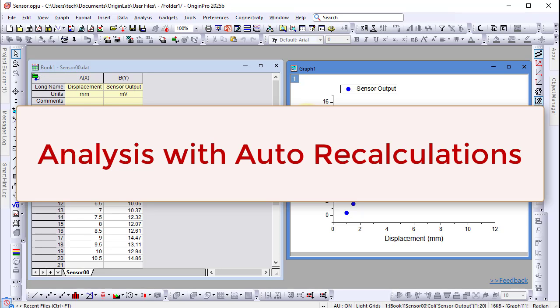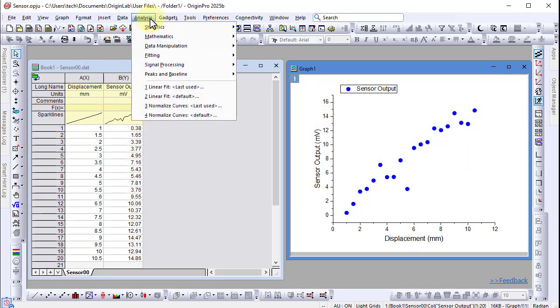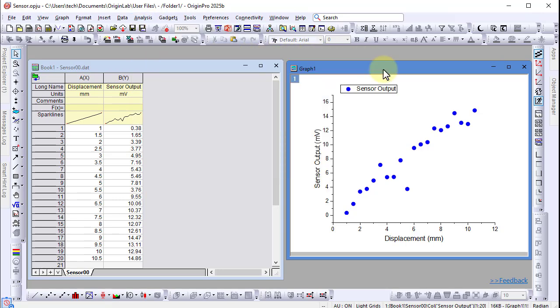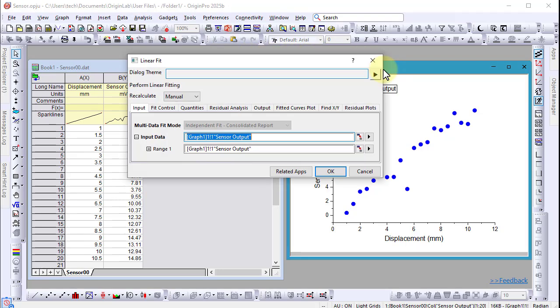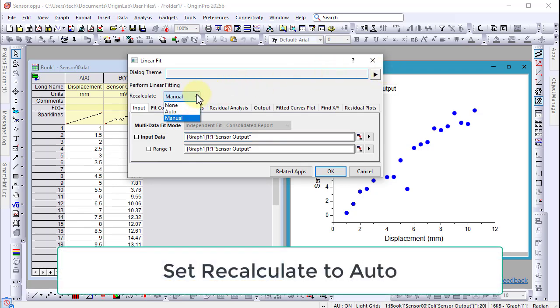In Origin, most analyses support recalculation. For example, if I perform a linear fit on my data, notice I can set the recalculate mode to auto.